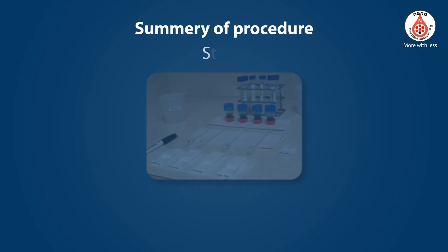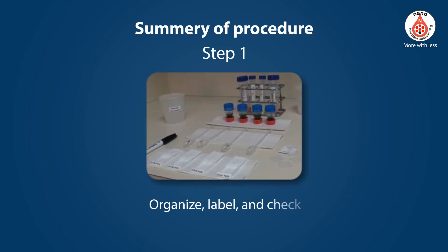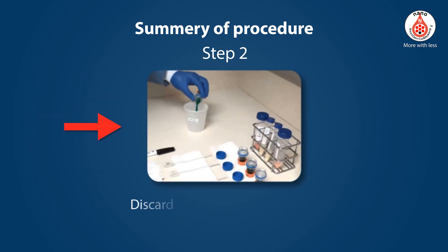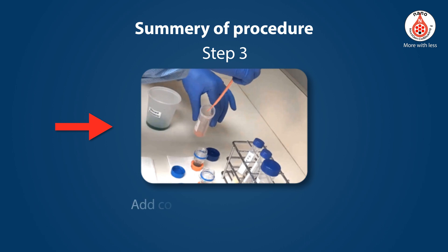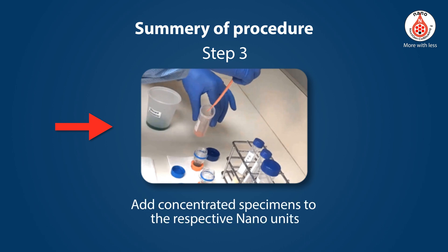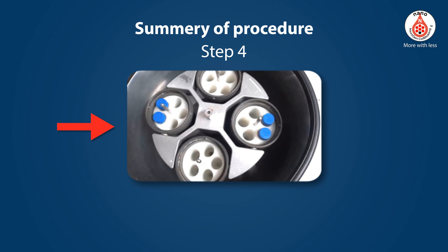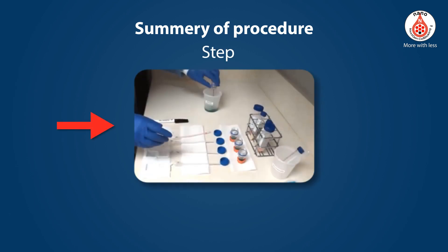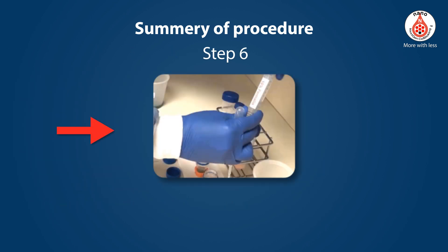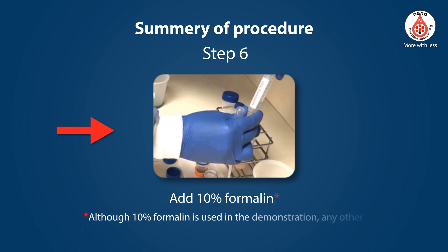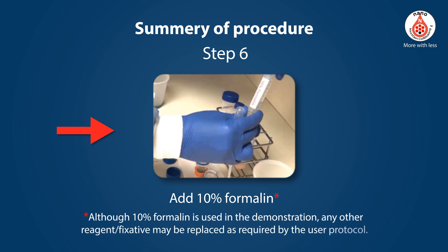Summary procedure. Step 1: Organize, label, and check. Step 2: Discard the green transport fluid. Step 3: Add concentrated specimens to the respective nano units. Step 4: Centrifuge at 2500 rpms for 3 minutes. Step 5: Discard the supernatant. Step 6: Add 10% formalin. Although 10% formalin is used in the demonstration, any other reagent or fixative may be replaced as required by the user protocol.